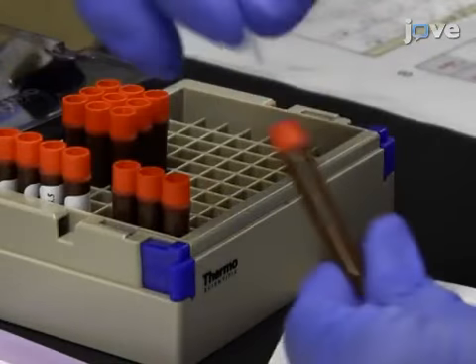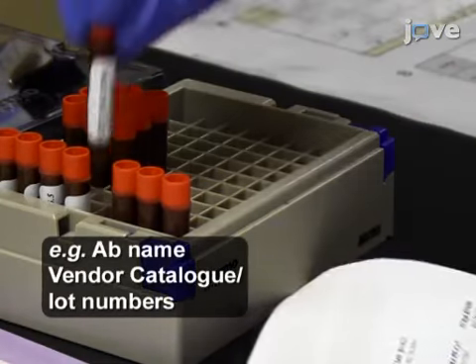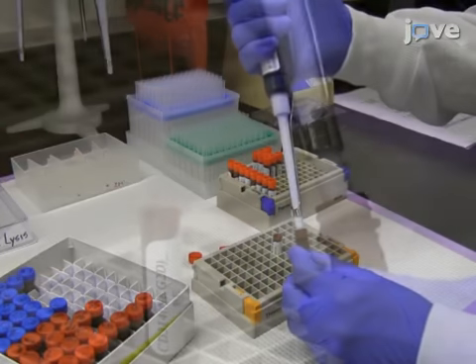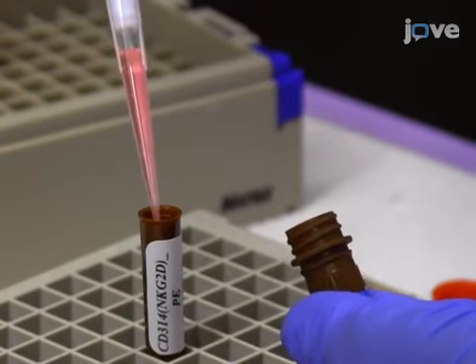Before beginning the procedure, apply human-readable labels to 2D barcode tubes. Next, transfer the entire contents of each vial of antibody into the appropriate corresponding 2D barcode tubes, taking care to avoid bubbles.